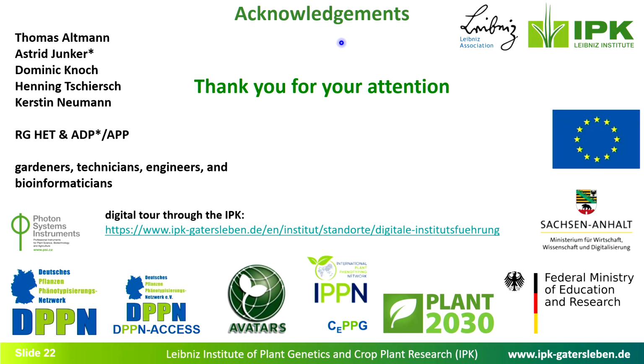But one experiment I didn't tell you about: there was also a control experiment between the average climate and the simulation experiment, where I just used two genotypes in every container to estimate positional effects. So we had a setup where we reused the soil as it was. Then we just exchanged the top layer, and we totally exchanged the whole volume. And what I found is that we have a very mild effect.